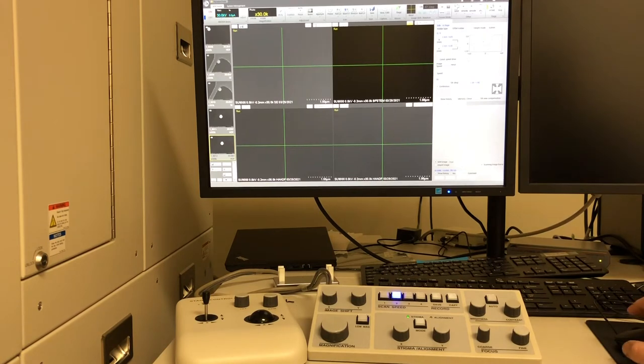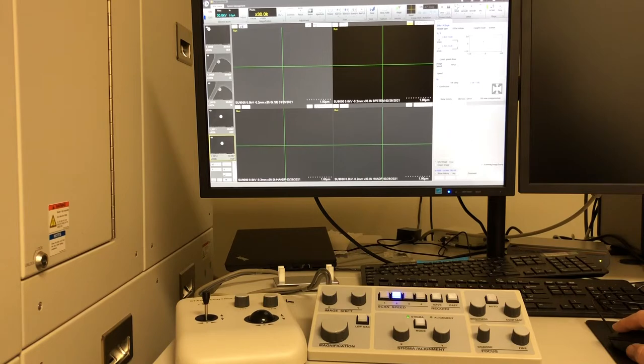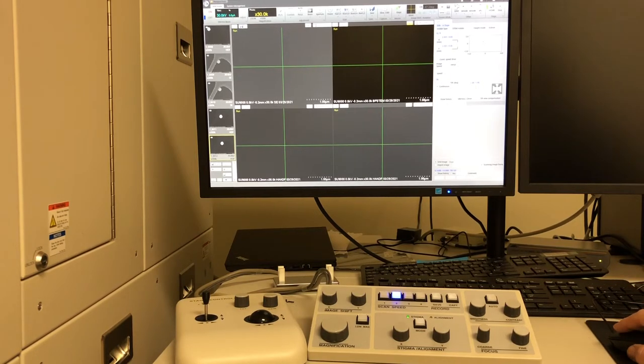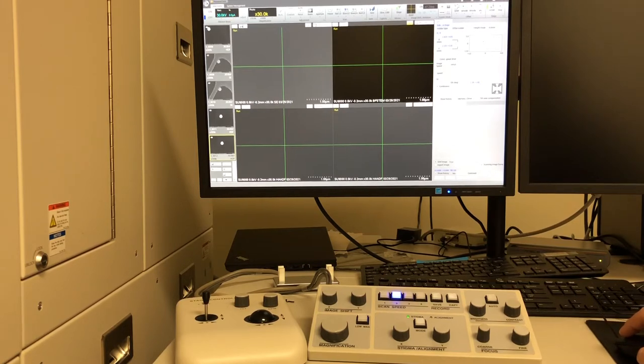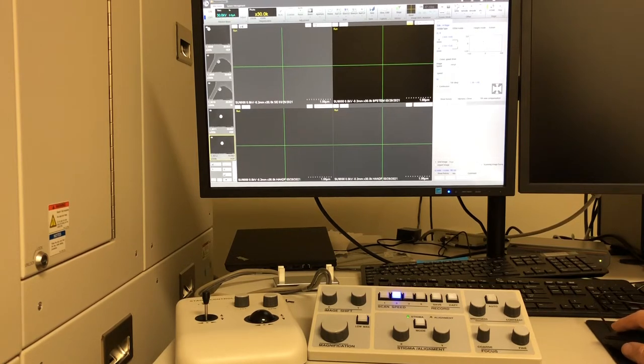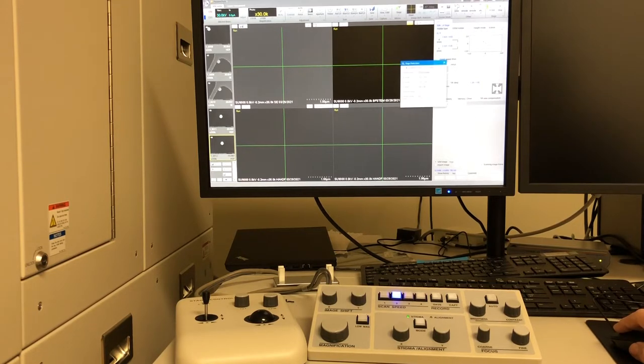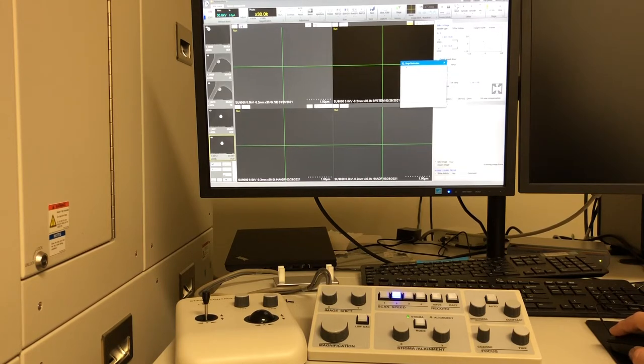Once you've inserted your sample into the SU-9000, there's a number of things that you'll have to do before getting a good image. The first thing is to come to the stage settings here on the right panel. You'll press the settings button and then make sure that you have the right holder type selected.